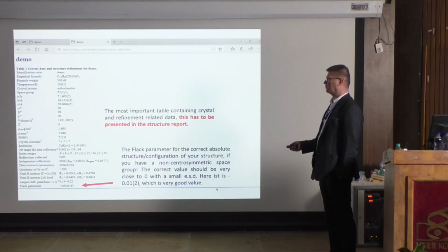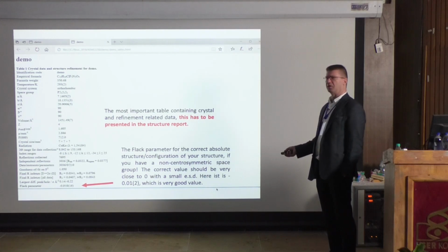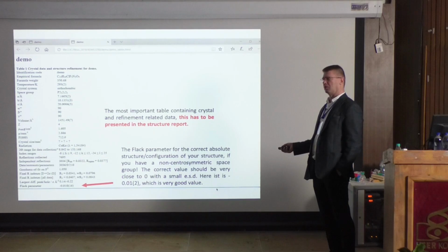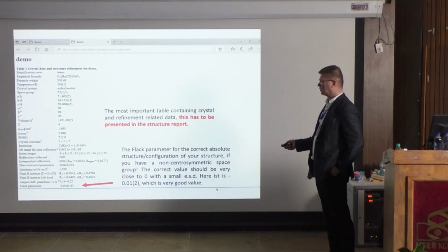And in this case, it was not measured, we didn't have the information anywhere, so it gives a question mark on that. But the nice point in here is that you can edit this. So you can go there and then you have your notes, and the notes say that, okay, the crystal is 0.1 times 0.2 times 0.3, and then you type it there.